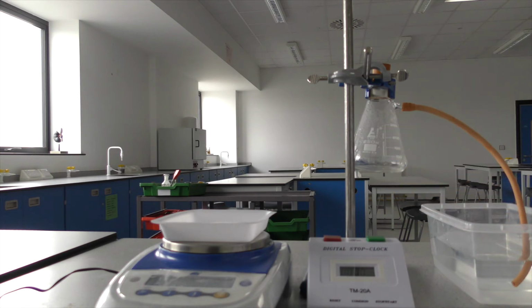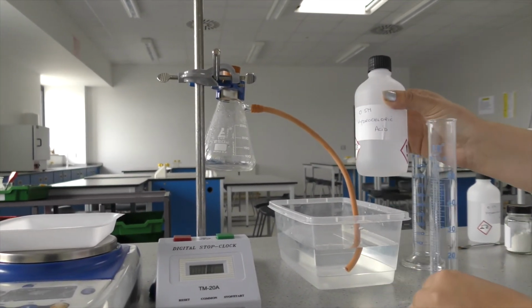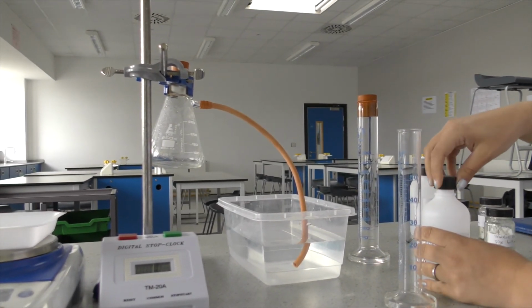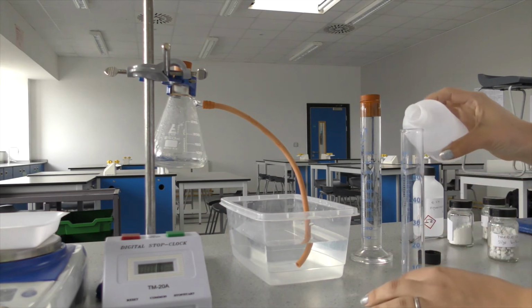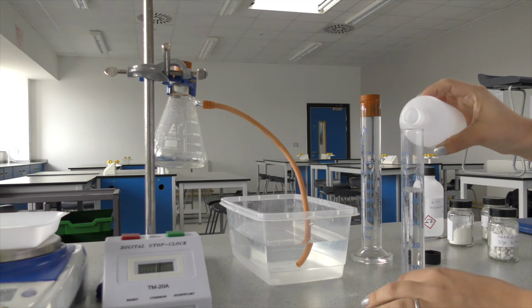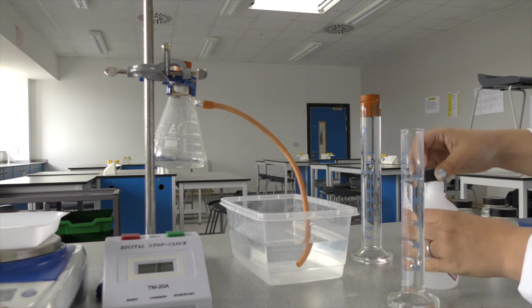The other variable we need to keep the same is our volume of acid and our concentration of acid that we use. So I'm going to measure out 50 mils of hydrochloric acid. This is hazardous, so I don't want to get it on my hands. If I do, I would either tell my teacher or rinse it off immediately. There we go, there's our 50 mils.